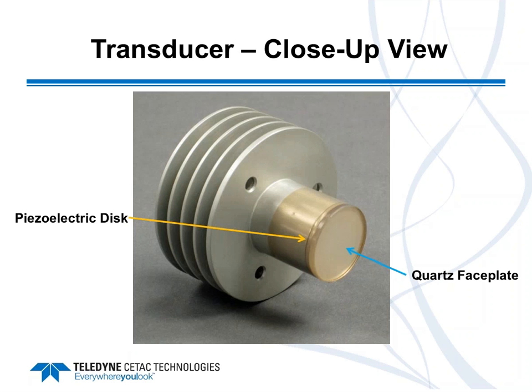Here is a close-up view of the transducer, and what I'll point out is there is a piezoelectric disc denoted by the orange arrow. On top of that is placed a quartz faceplate. And the liquid sample will be pumped across that quartz faceplate. The vibrations are coupled from the piezoelectric through the quartz, and the aerosol is generated.